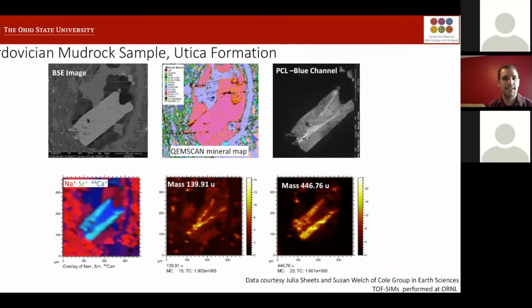And like I said, they've done a lot of work on this before, so there's some cool comparisons that we can do from their work with their SEM at SEMCAL. So if you just looked at this normally, you would assume for backscatter imaging, it's a fairly uniform crystal. Even if you're doing EDS mapping from it, you can see that it's identified basically as apatite from its concentrations.